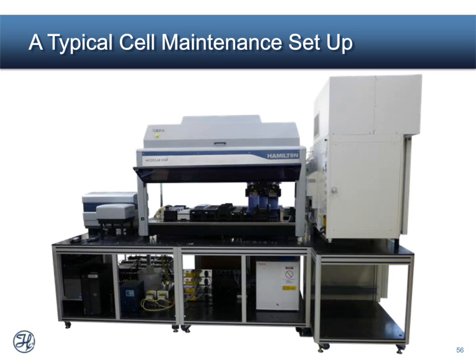On top of the liquid handler in the middle, you can see that there's an integrated HEPA filter hood to keep the pipetting surface a clean work zone. And then on the left-hand side of the liquid handling platform, you notice there's a confluence imager and a BioTek reader to do quantitative analysis. And then below the instrument platform, we have refrigerators to keep media cooled, and then it can be heated on the way to the instrument platform to 37 degrees for processing cells, and as well as other control units and modules underneath.